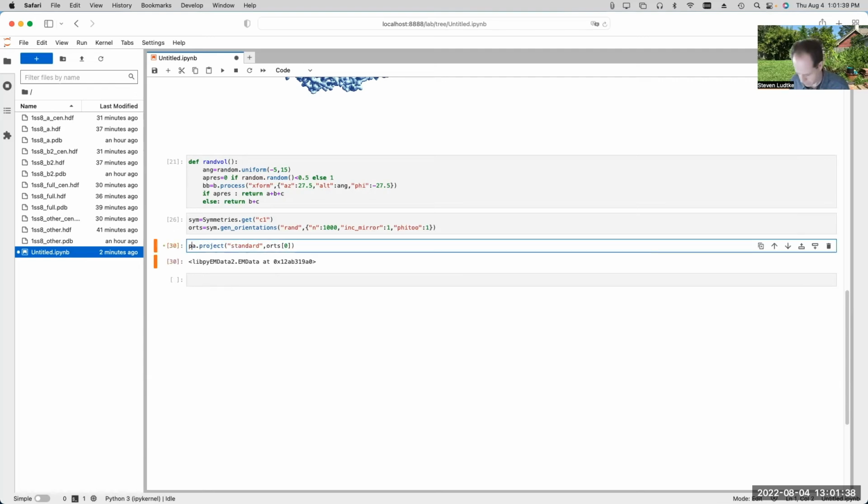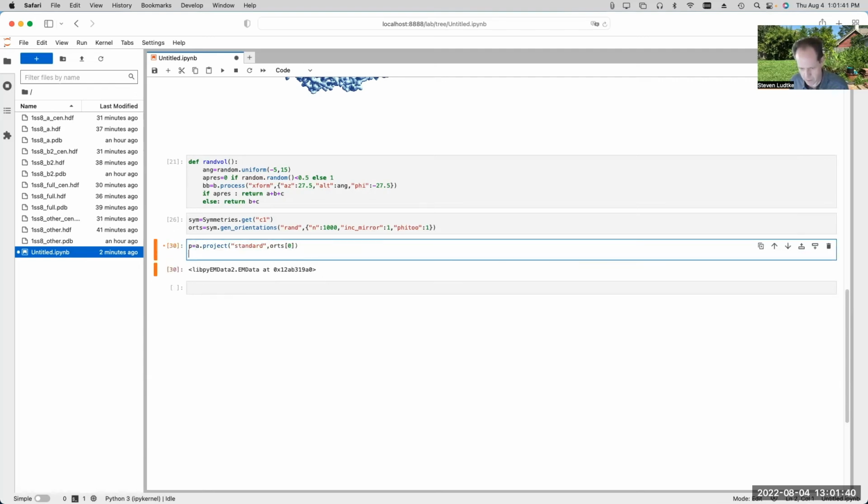I'll do this just to show you what it looks like. E3, and I won't go too much longer. I know we've been going an hour already. Display P image.